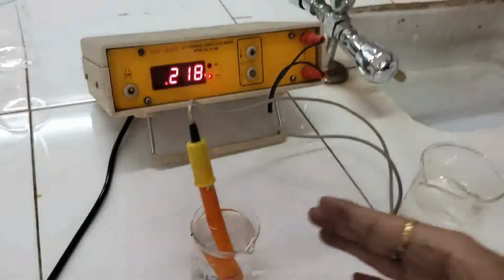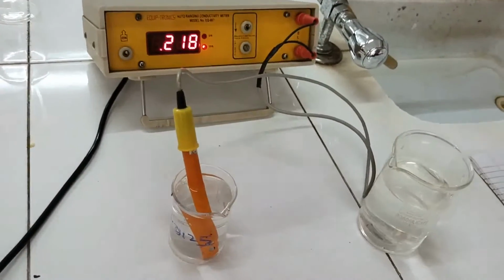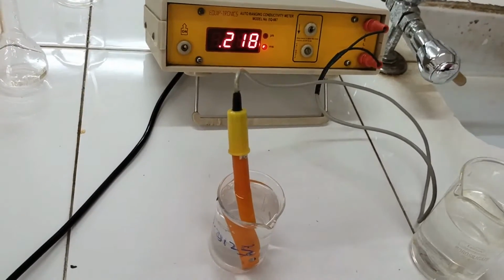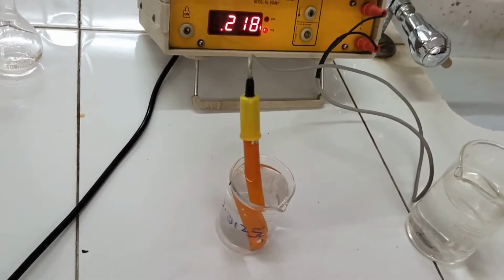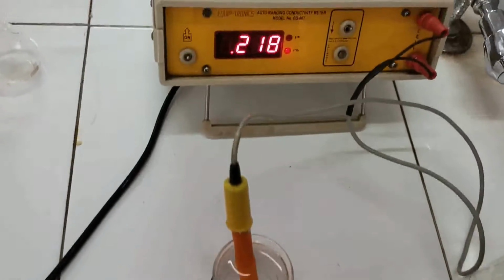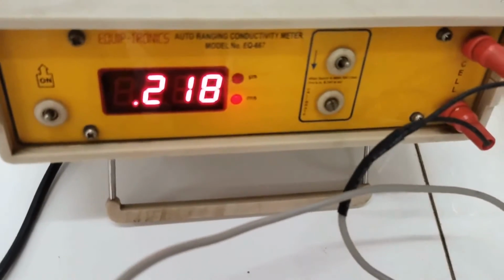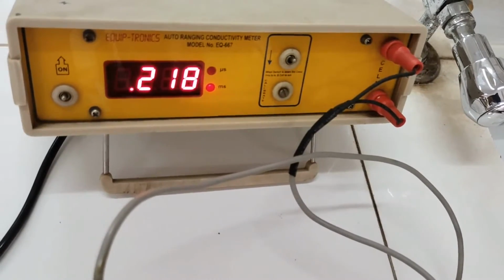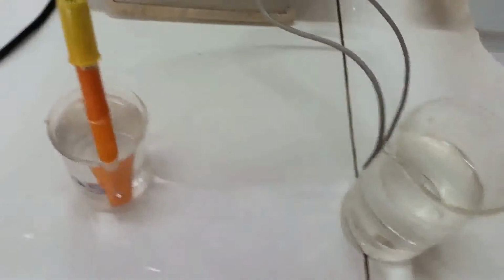Okay, but here instead of throwing away the solution, I kept the entire beaker which I prepared, 100 ml. Otherwise, this half of the beaker is also enough. Please keep this in mind. So you can check the reading now. It is 0.218. Of course, it has to be multiplied with a factor of 10 raised to minus 3 because we are taking it in terms of Siemens.